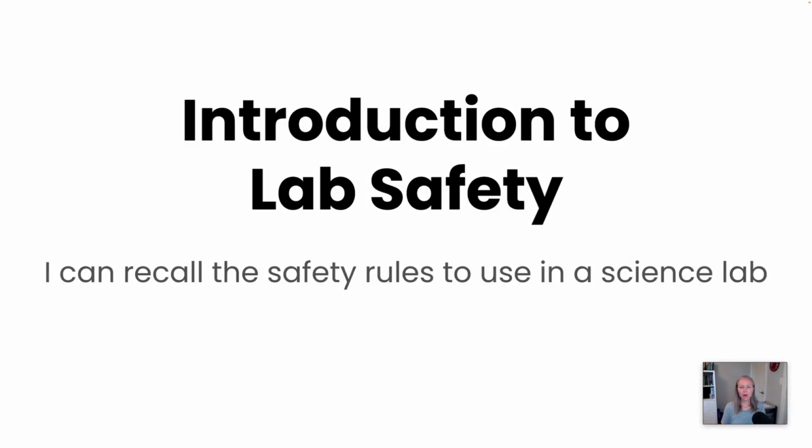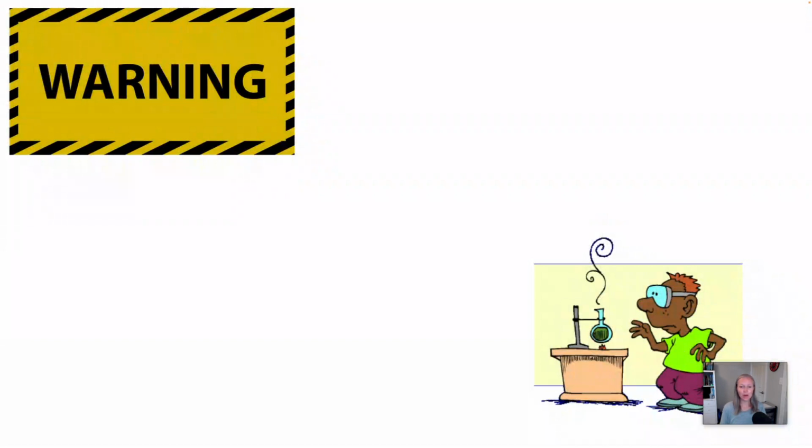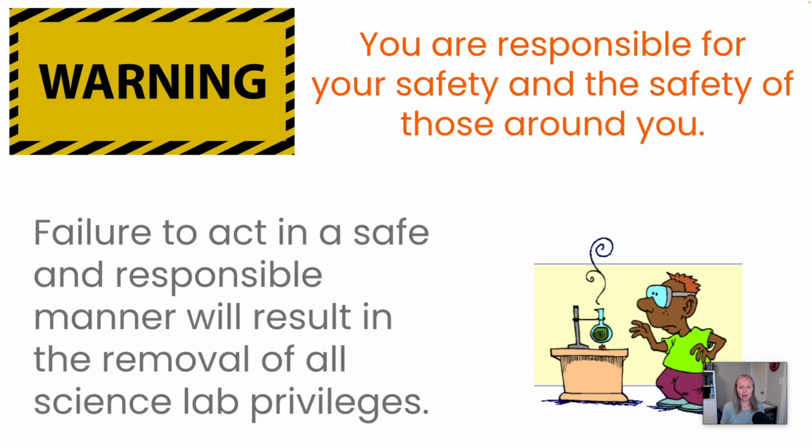In this video, we're going to look at lab safety, and specifically, our goal is to be able to recall the safety rules to use in a science lab. So let's get started. First off, you are responsible for your safety and the safety of those around you. Lab safety is so important.